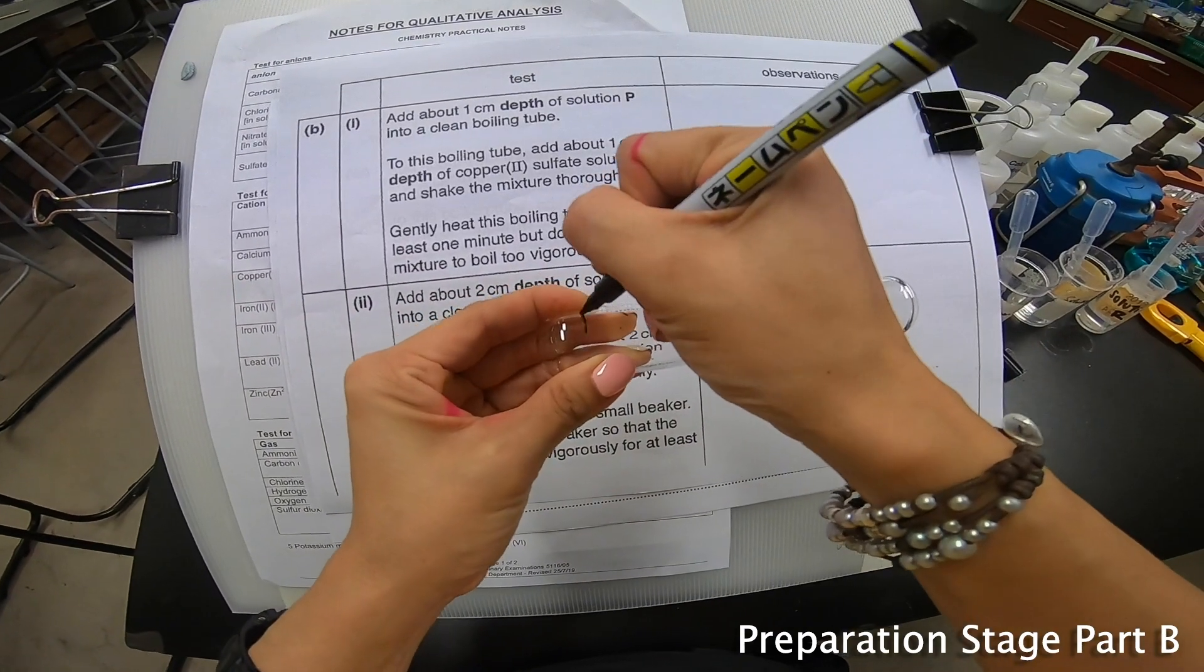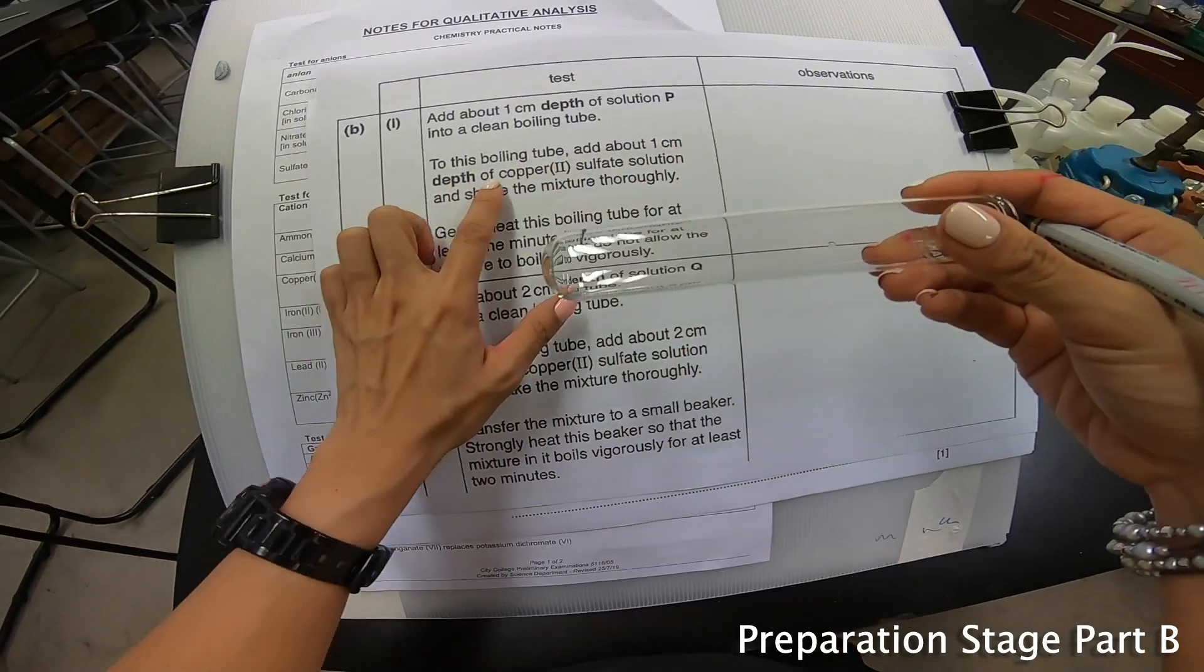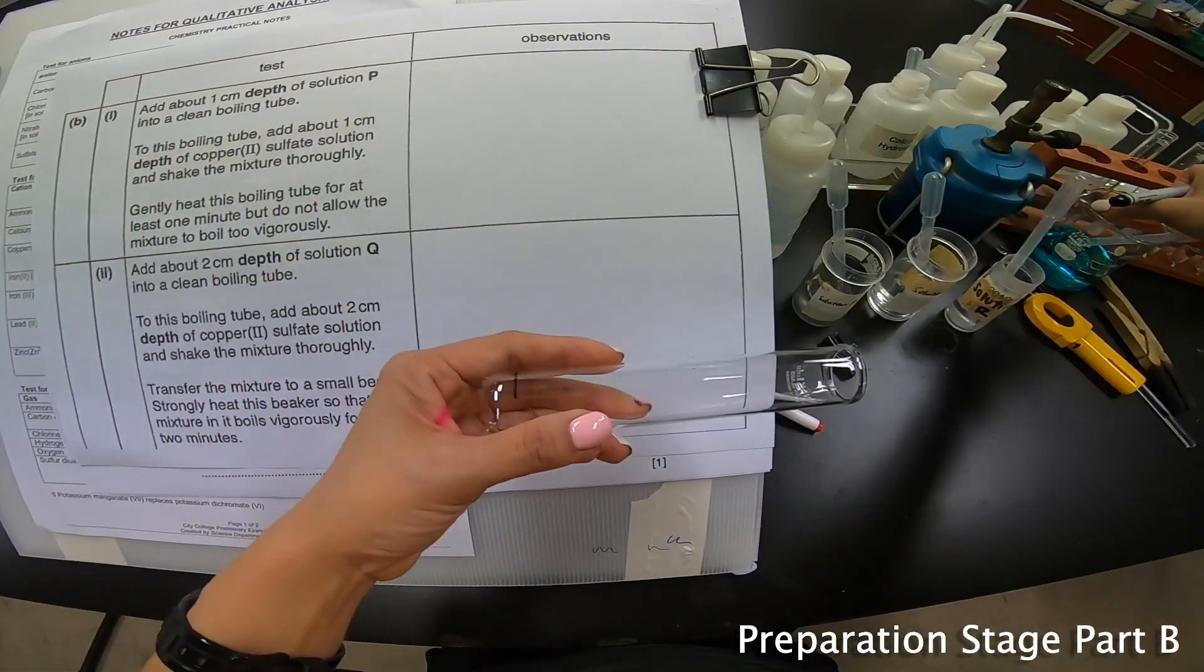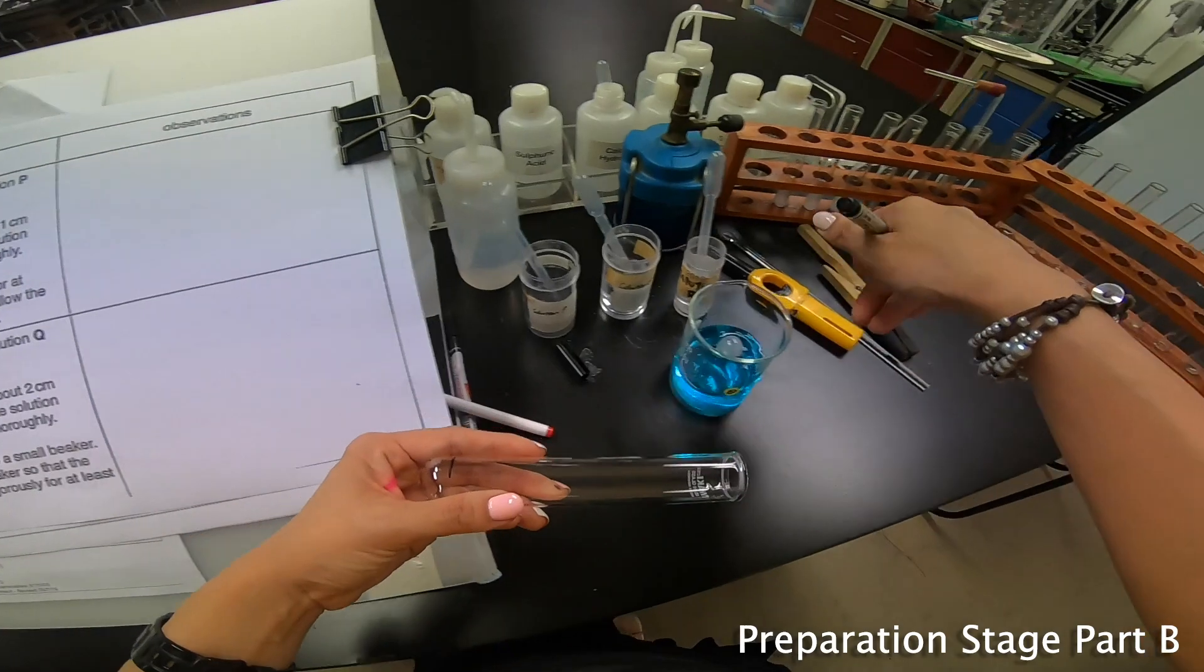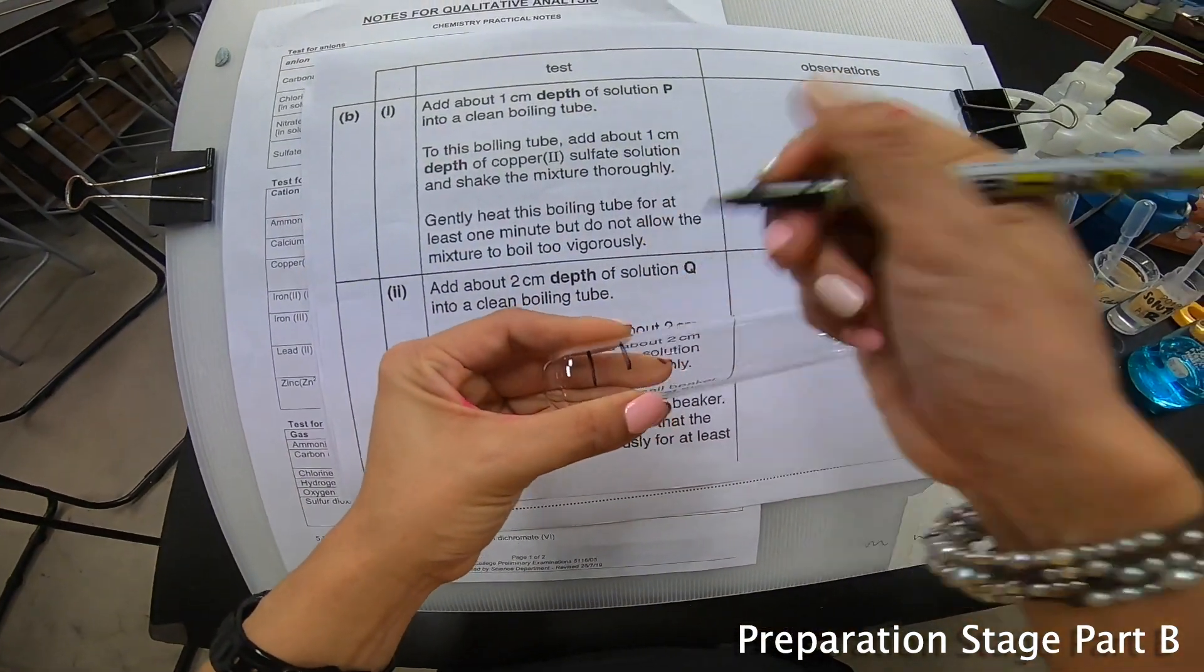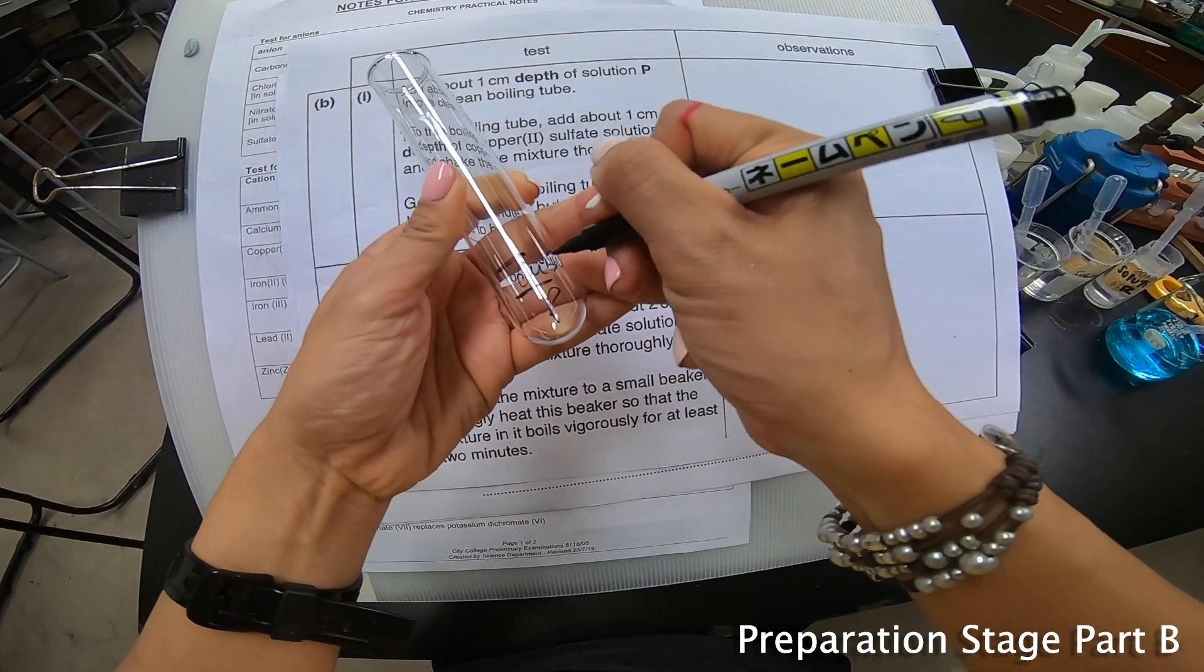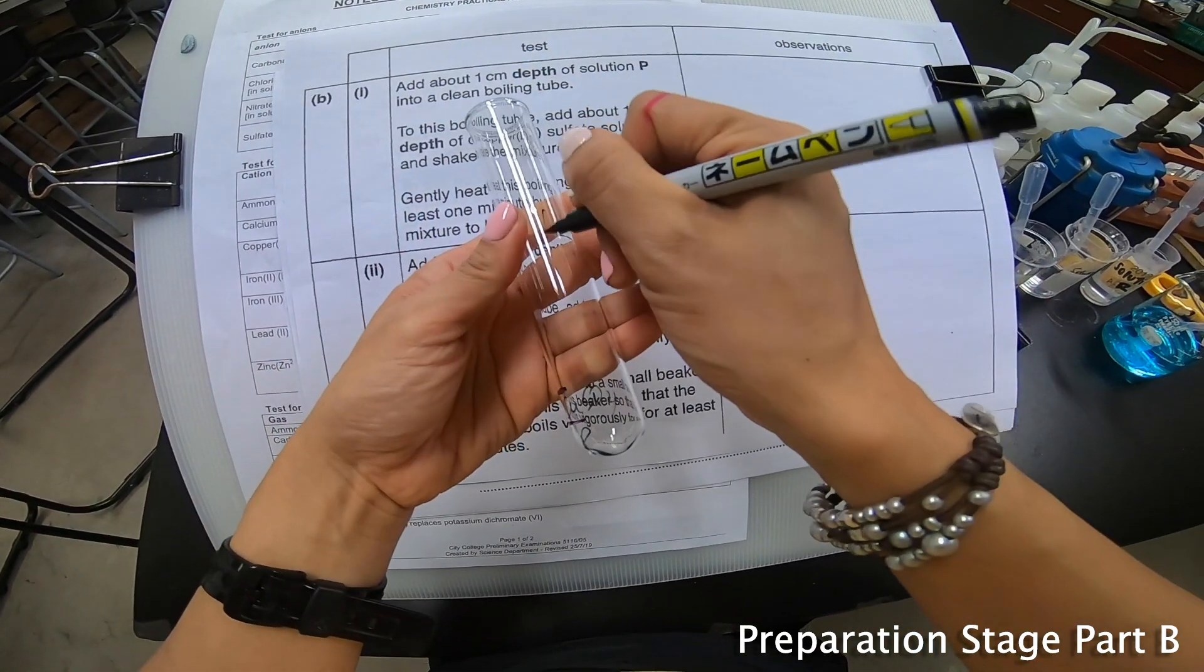Add about 1 cm depth of solution P into a clean boiling tube. This is a boiling tube, 1 cm. So ready? Let's prepare. 1 cm P and then to this boiling tube add another 1 cm depth of copper 2 sulfate solution. This is copper 2 sulfate solution over here. So I add another 1 cm. So this is P, this is CuSO4. Making sure that I write this as B part 1.